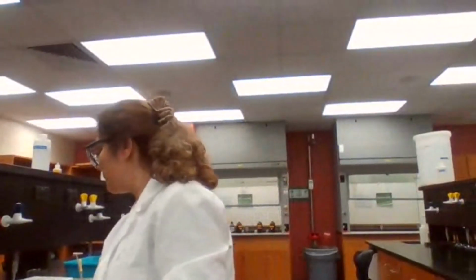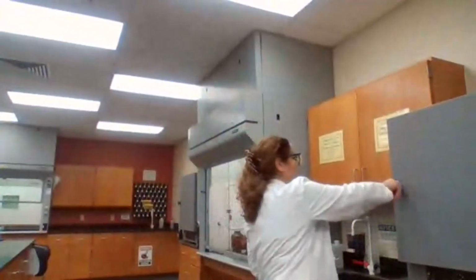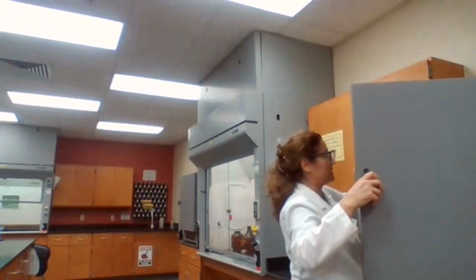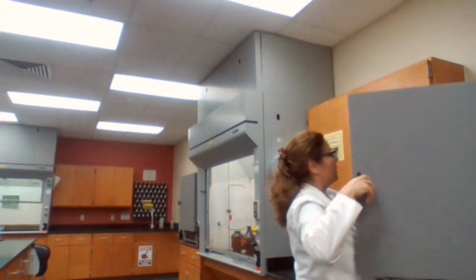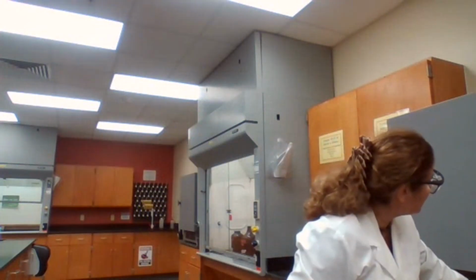The sample, the crystals look all right. Because I have the mass of the filter paper, I'm using the mass of the filter paper only. As long as you stay consistent with what you started with, let's say you have the mass of the filter paper only, you have the mass of filter paper and the product, you can get the mass of product.